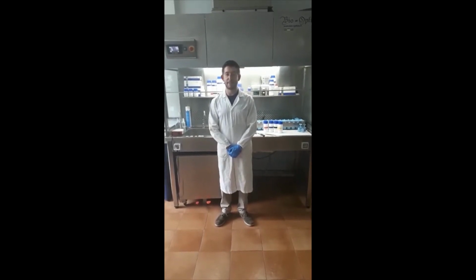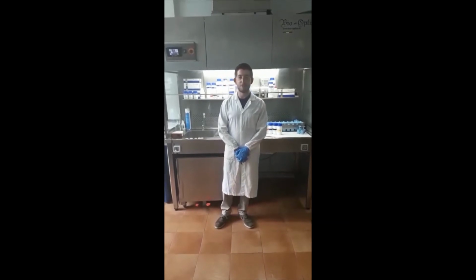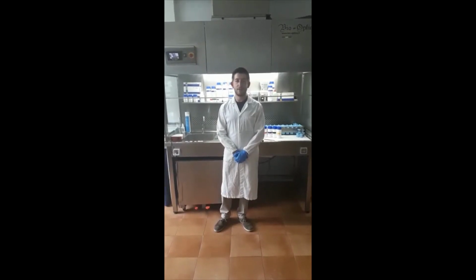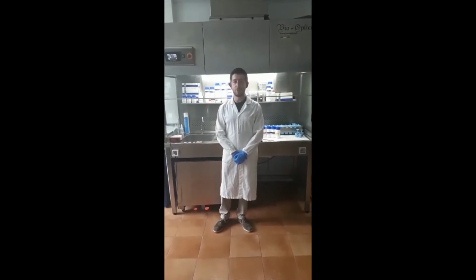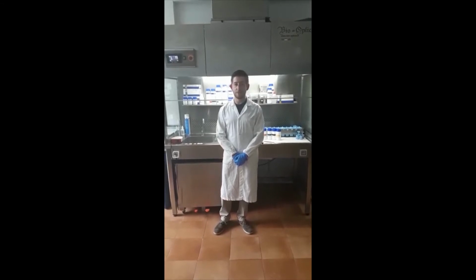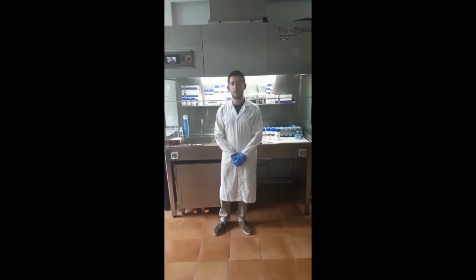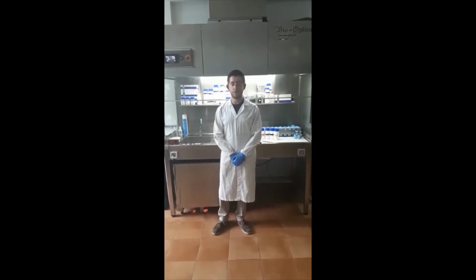What are biomarking dyes? They are special inks that are used to mark the surgical margins. We use them especially when we have to distinguish under the microscope different surgical margins, and it is important to use different colors in order to recognize them. Now we can see how they work.